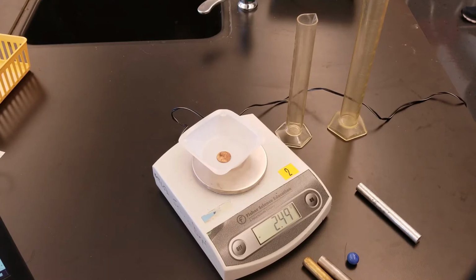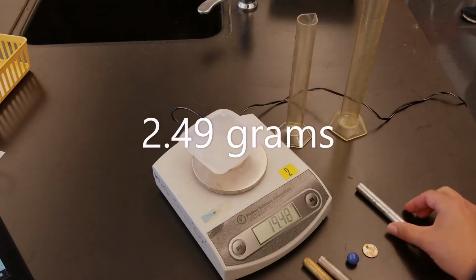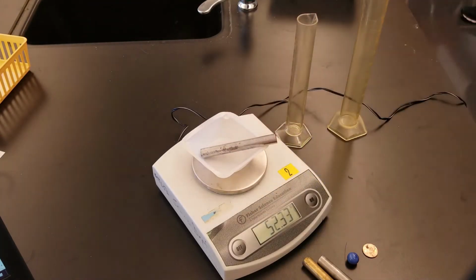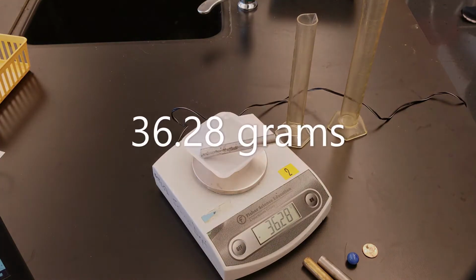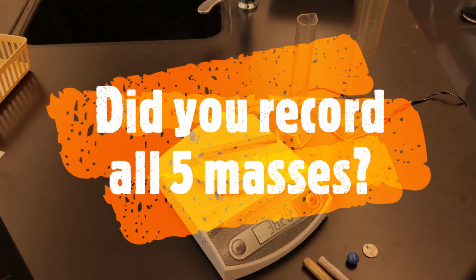Mass of the penny. And finally, the mass of the 10 centimeter silver colored rod. Double check that you have recorded all 5 of these values.